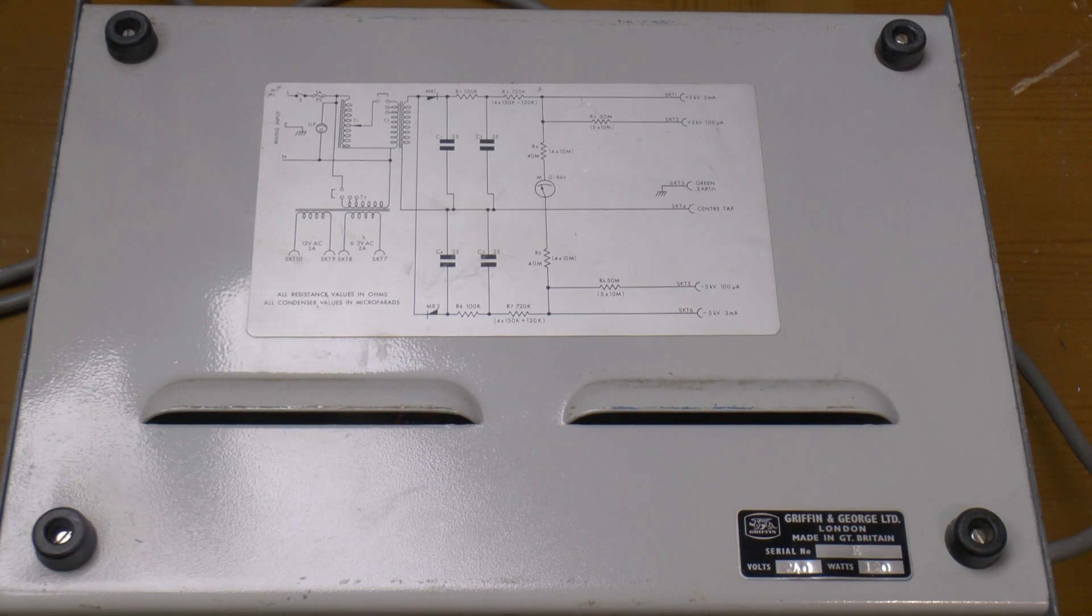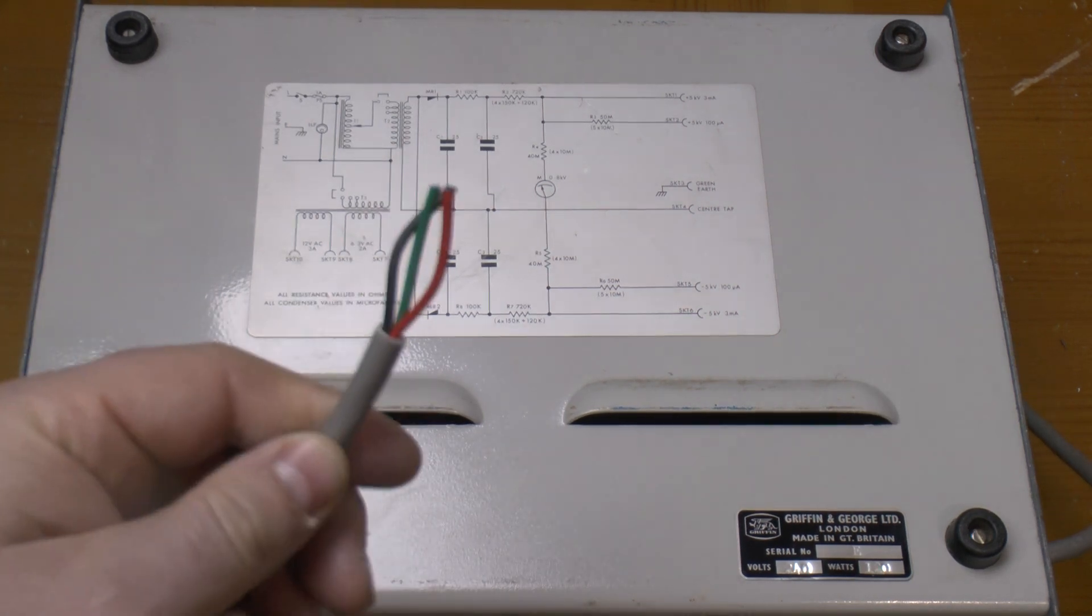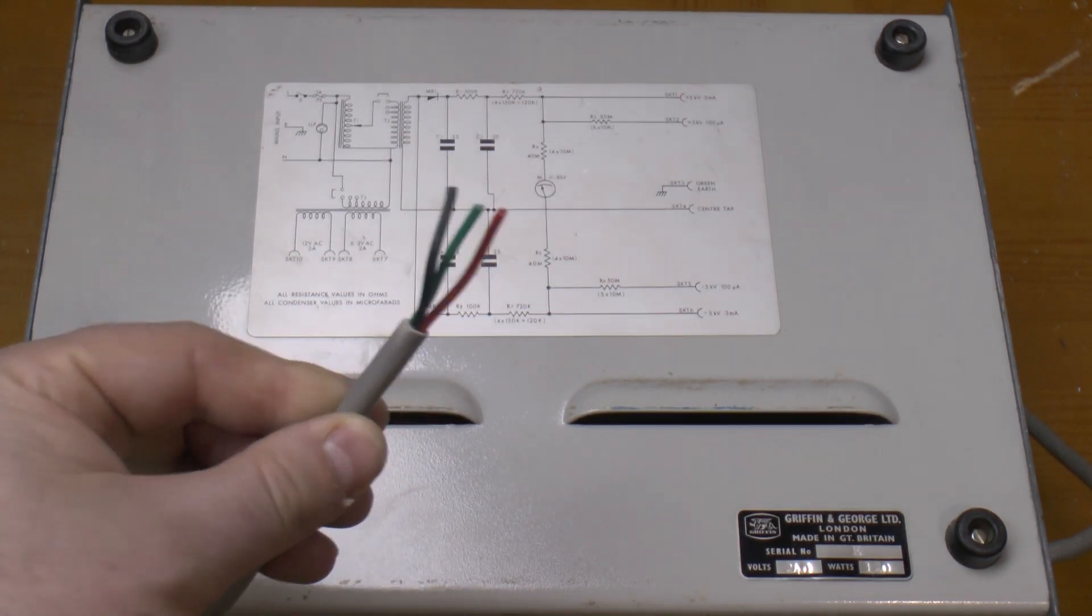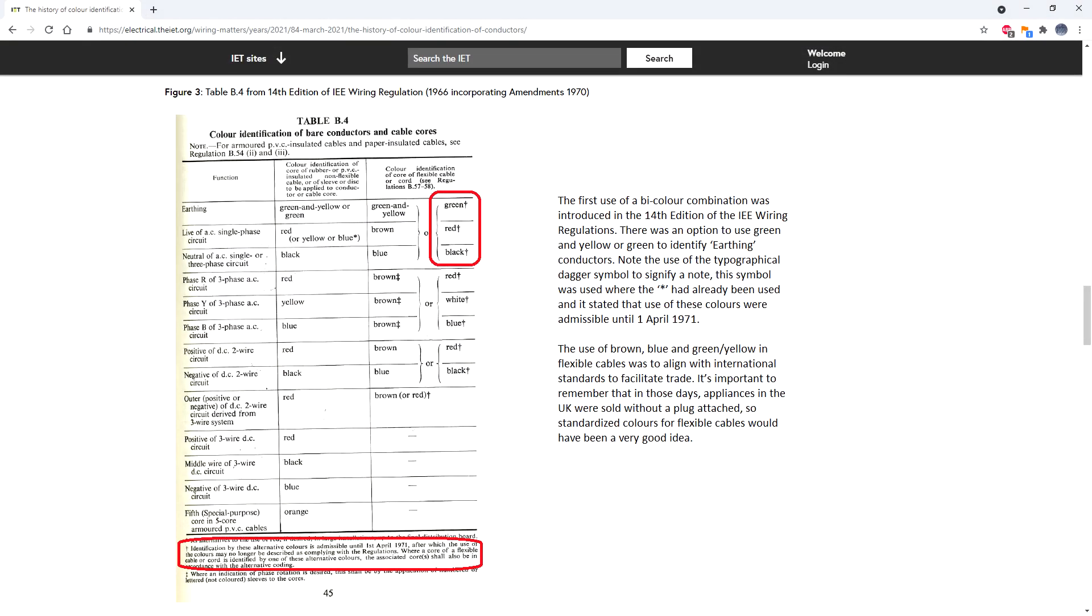Let's take a look inside and see if we can figure out how old it is. Before I do though, there's a clue as to the youngest it could be. Look at the cable. That cable color code was only permitted until the 1st of April 1971, so that's the newest this unit can be. It's at least 50 years old.